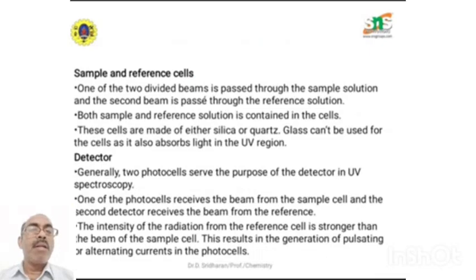Sample and reference cells: one of the two divided beams is passed through the sample solution and the second beam is passed through the reference solution. So the double beam technique results are very accurate and we can get better resolution.